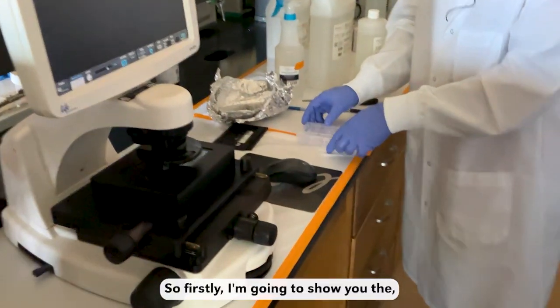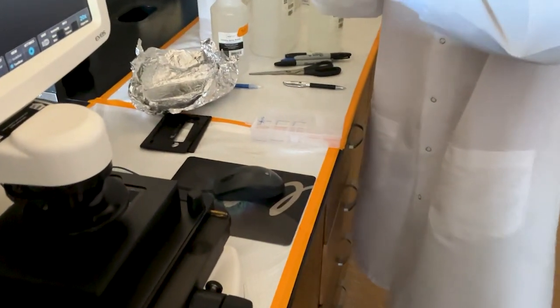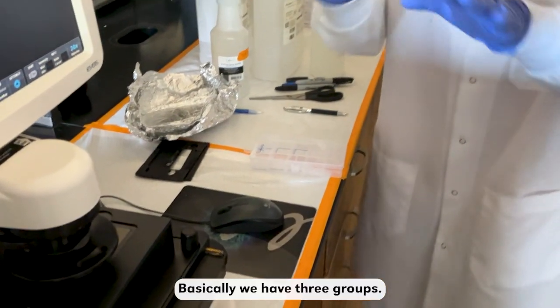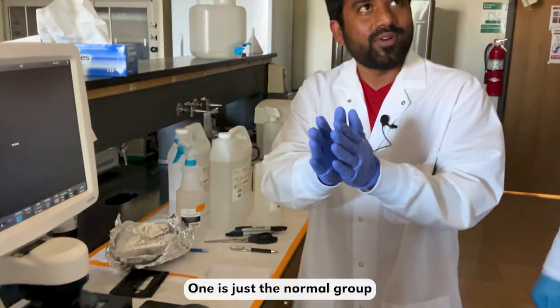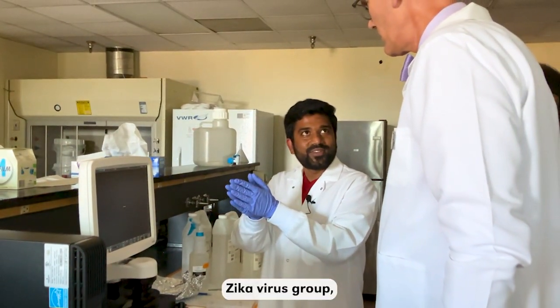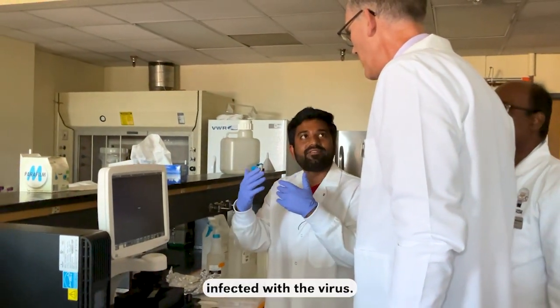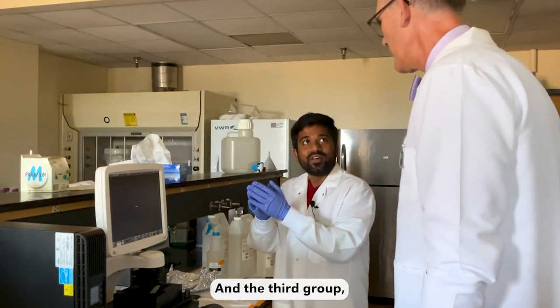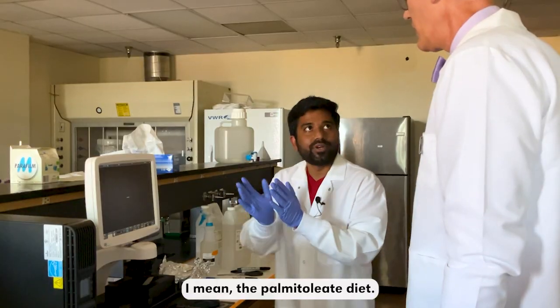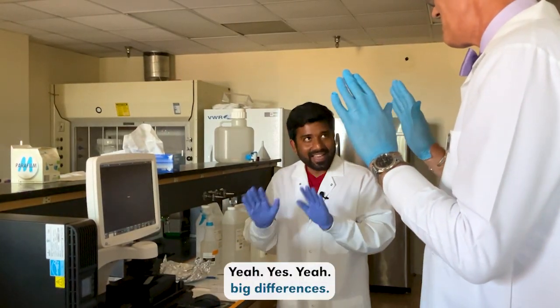So firstly, I'm going to show you the Zika virus group. Basically, we have three groups. One is just the normal group, which is not infected. The second group is the Zika virus group, which is infected with the virus. And the third group, we infected with the virus and also gave the macadamia, the palmitoleate diet. And I'll be able to see big differences.